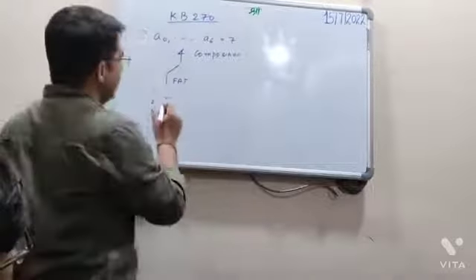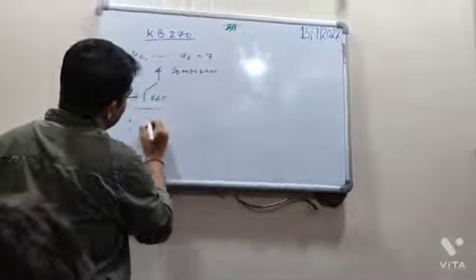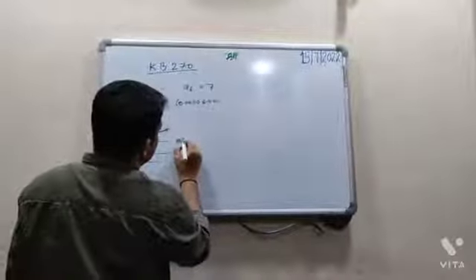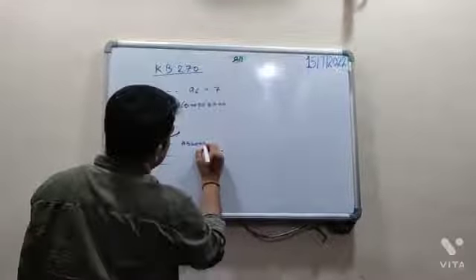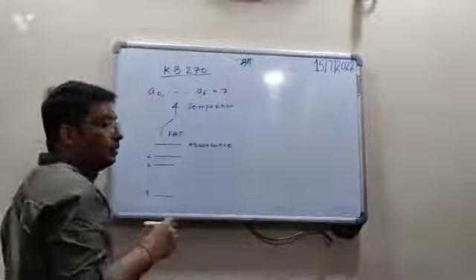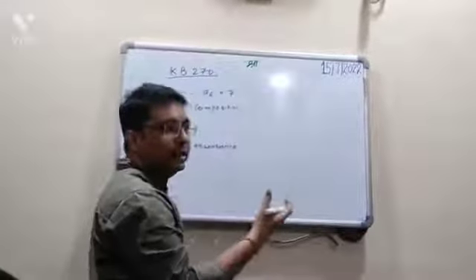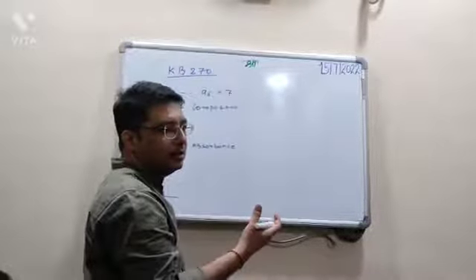Agree? Okay. Now, for each sample you are getting absorbance, and absorbance was written in other variables.